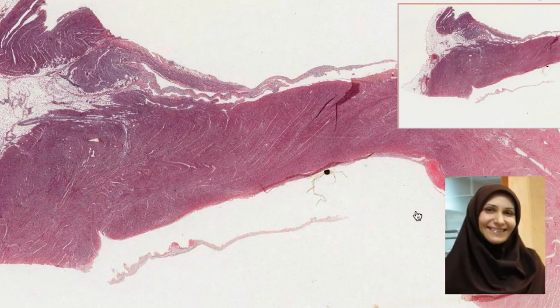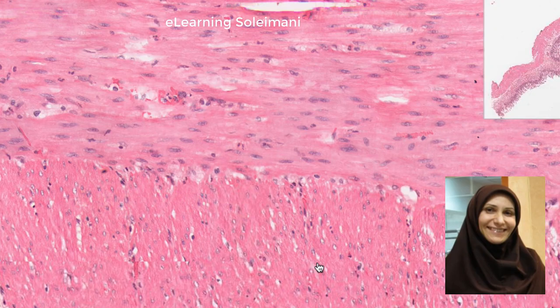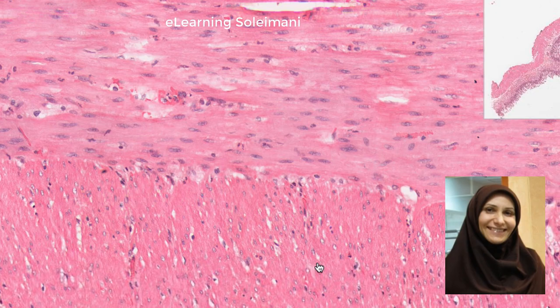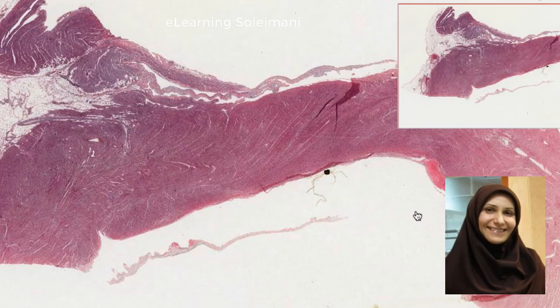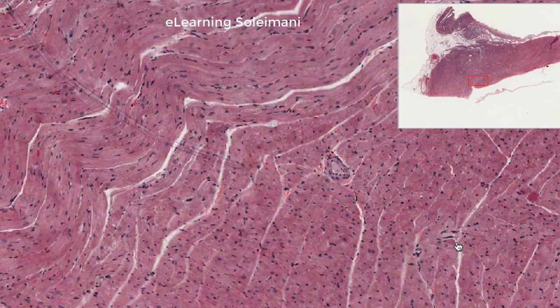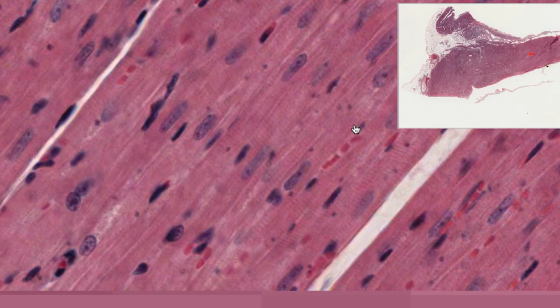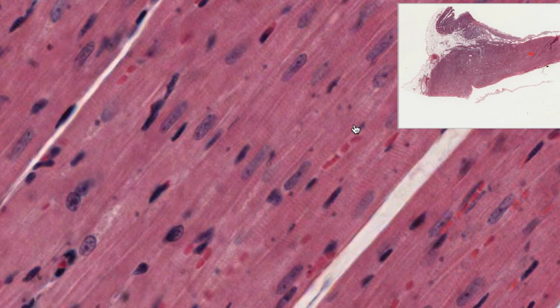The muscular tissue consists of three types of muscles: cardiac muscle, skeletal muscle, and smooth muscle. In cross-sectional views, the twisted shape of the cardiac muscle makes it difficult to distinguish between its longitudinal and transverse sections. With higher magnification, the details of the cardiac muscle become more visible.